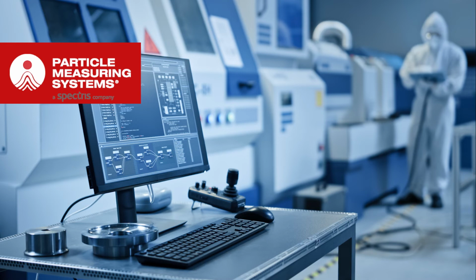Is it of a uniform dispersion of particles within that area, whether it be in an ISO 7, ISO 8, or in the ISO 5 unidirectional flow? You're trying to make sure that there are no hotspots. And that's obviously an immediate sign that there might be a risk. If there are hotspots, worst case scenarios, if you will, and that's a phrase that people love to knock around, if you have a worst case scenario, fix it before the risk assessment.